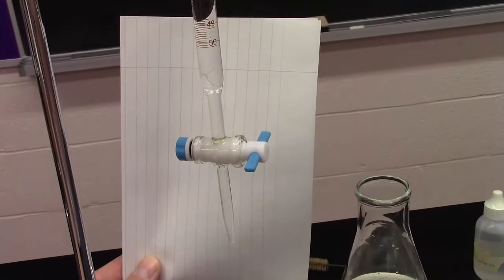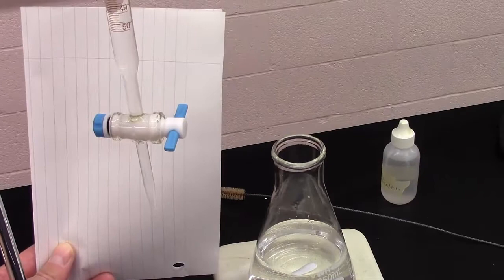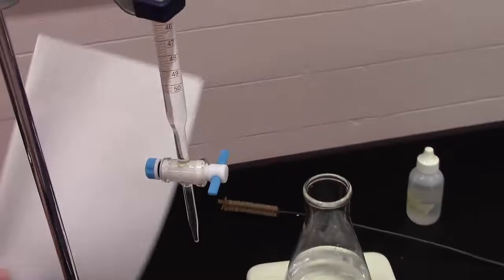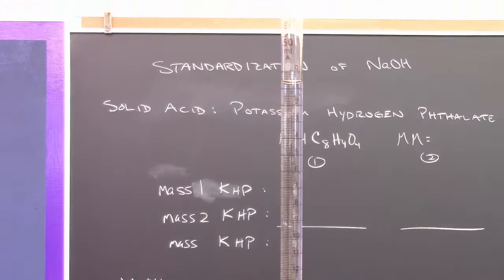If I turn that valve 90 degrees from where it is right now, then the burette will be fully open and liquid in the burette will come out. Typically I'm going to have base in the burette and acid in the flask.